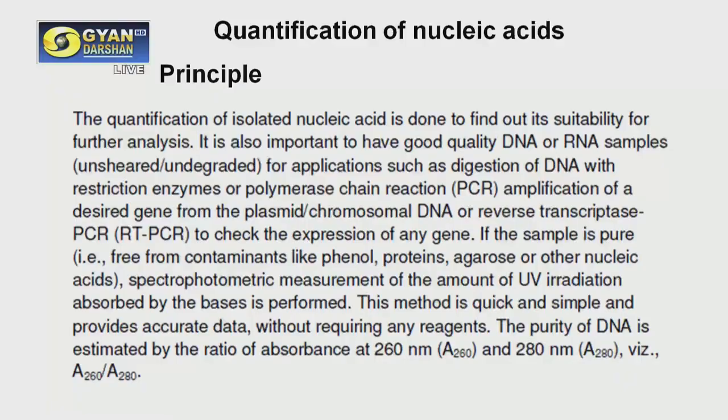The last experiment is the quantification of nucleic acid. What is meant by quantification? Quantification means I need to find out how much DNA has been isolated. I mean, per ml, how many micrograms or how many milligrams are present. How will you do that quantification? And how will you estimate the purity of the DNA? That is done through spectrophotometric measurements.